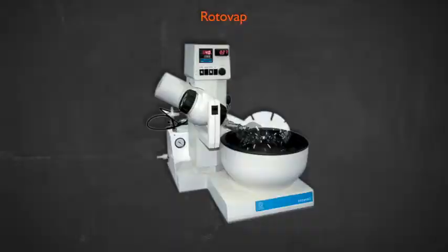So the Rotovap consists of really two main parts. I guess you could argue there are more than two main parts, but for the purposes of the discussion here, let's just say there are two main parts. There's this big bowl at the bottom, and this bowl is where you put the thing that you would like to vaporize. So you can put in your eucalyptus leaves, you can put in your chocolate, you can put in your Coca-Cola, whatever it is that makes you happy. If you're fortunate enough to have a Rotovap in your kitchen, you can choose what you put into this thing.